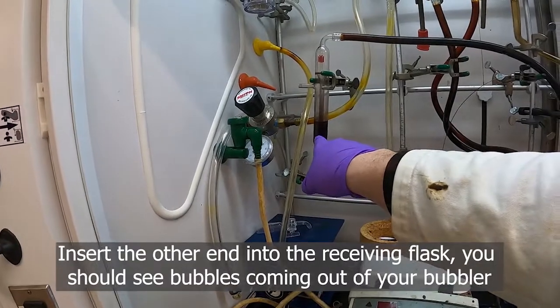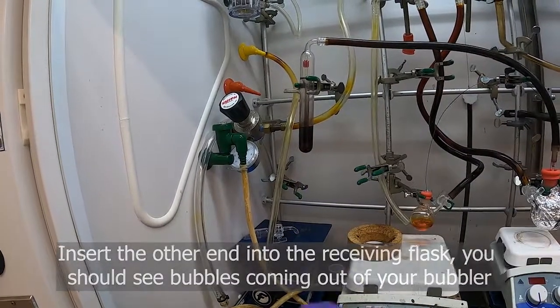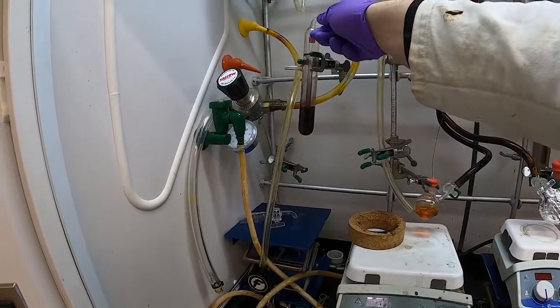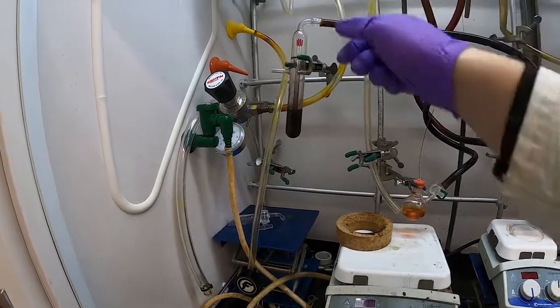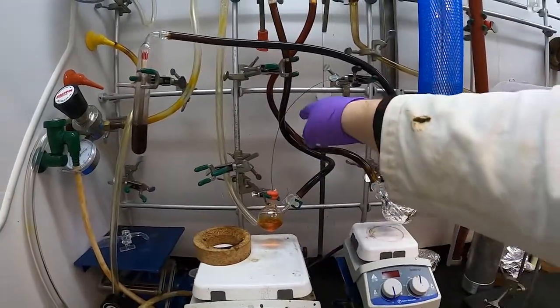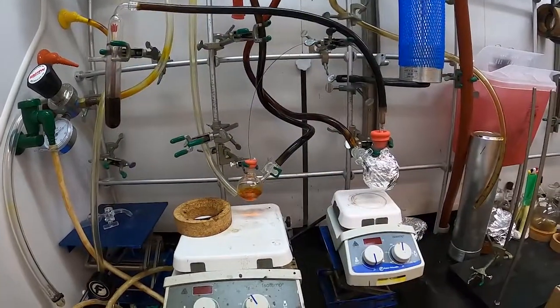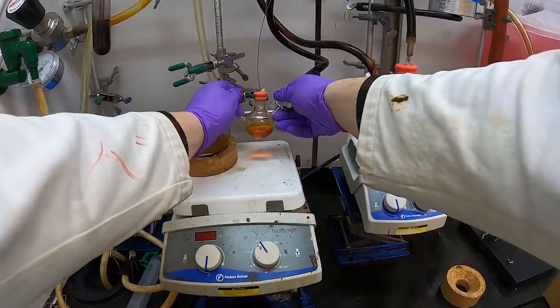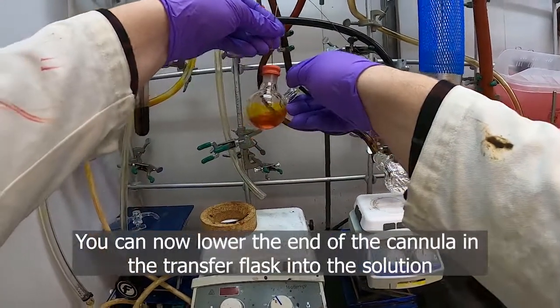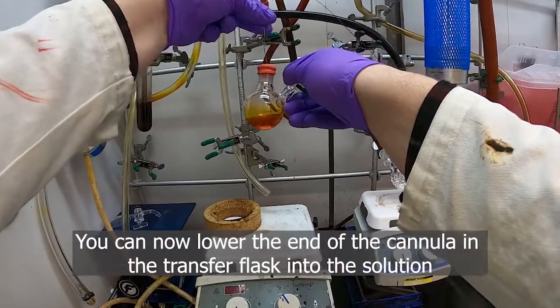We can see we're pushing nitrogen through because we're getting bubbles on our bubbler here. We're getting nitrogen through our flask, through the septum, through the cannula and into here and out of our bubbler. The next step will be to push our needle into our solution.